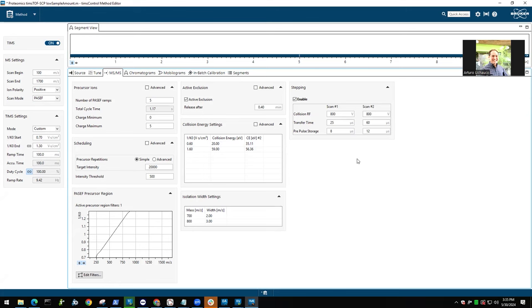Yes. As I said, those settings aren't the correct ones for TMT. I wouldn't recommend those. That can be done in this way, and if you want to have the correct method, you can contact me. I'm happy to share this.